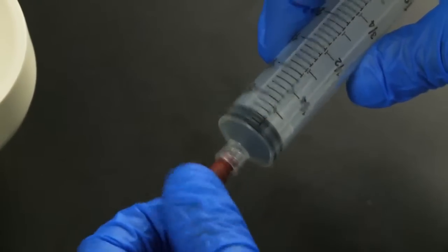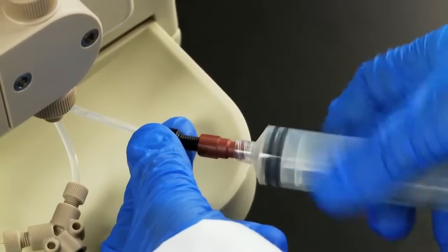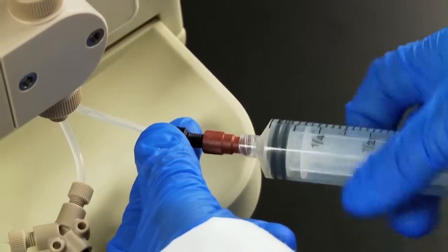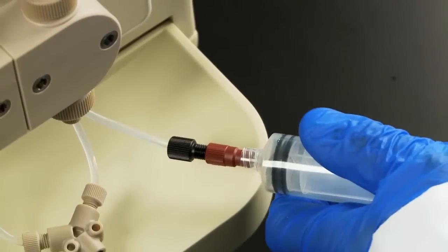Attach the quarter-twenty-eight lure adapter onto a 30 mil syringe and then join this assembly to the priming line. Withdraw the syringe plunger until washing solution appears in the syringe.